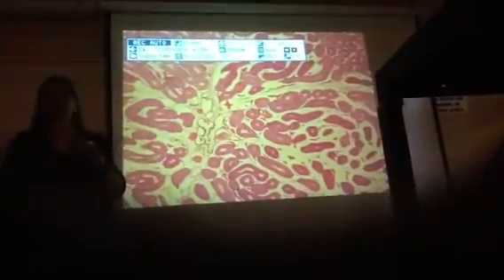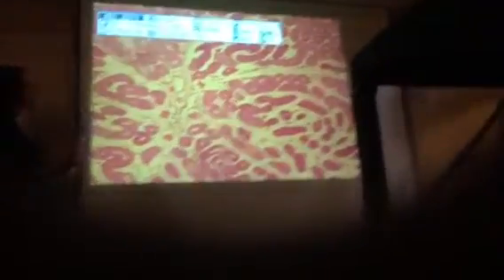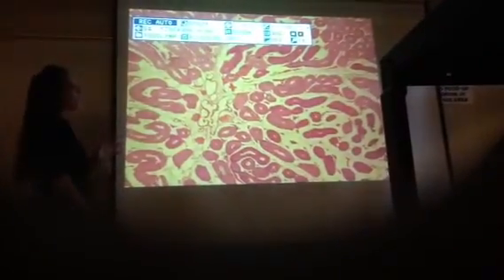What you may see, however, is sperm detaching from the seminiferous tubules. And sometimes that can be a little confusing. Sometimes the tail looks like a microvilli. So you have to tell the two apart.